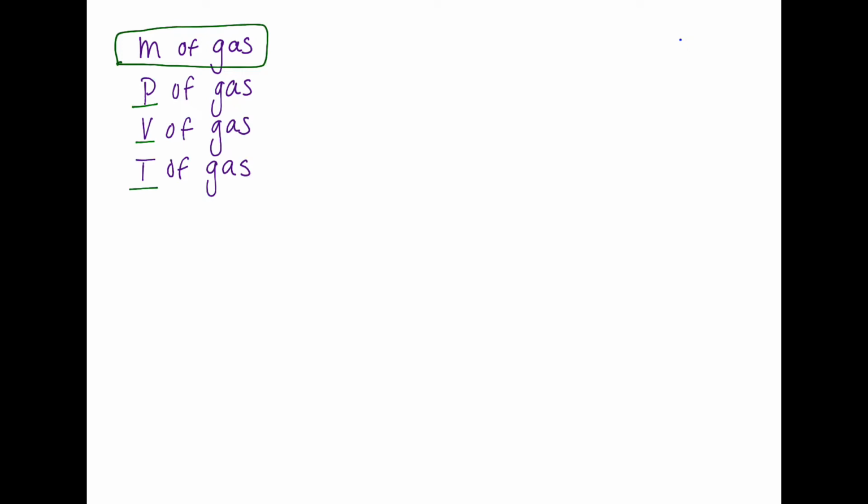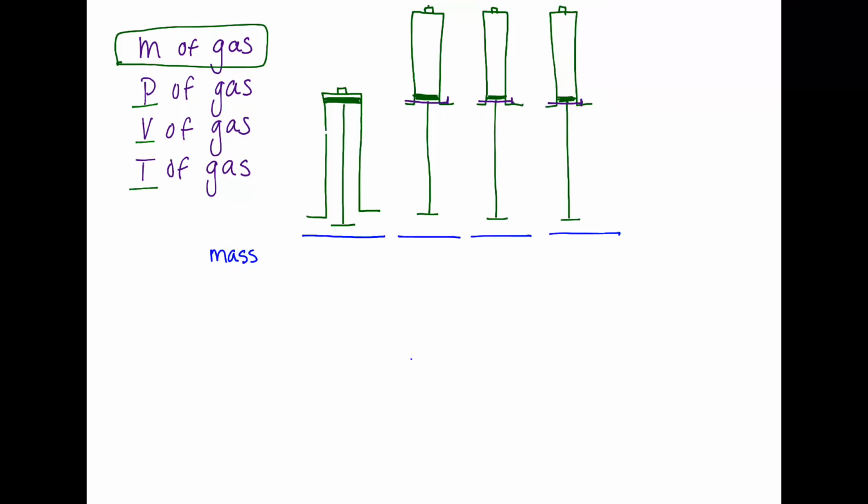The error is compounded by the fact that there are some buoyancy issues. And to talk about buoyancy, I want to show you some different situations. So I'm going to draw out some syringes that are filled and empty, and we're going to look at the relative masses. Before I show the actual masses, I want to talk about what each one of these syringes is that I drew. The first one here is empty.